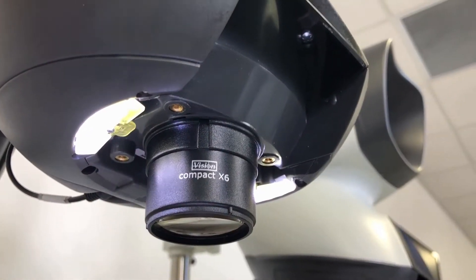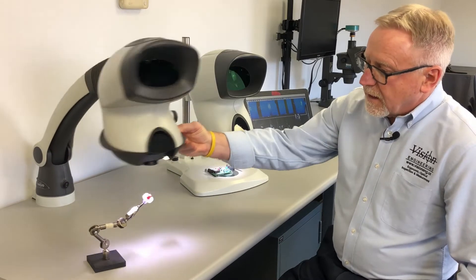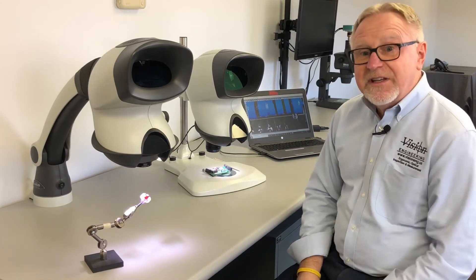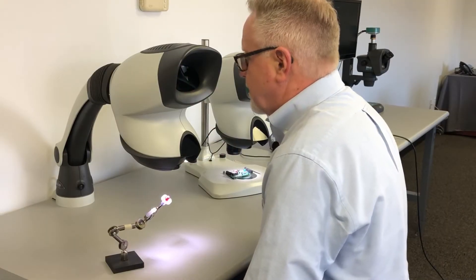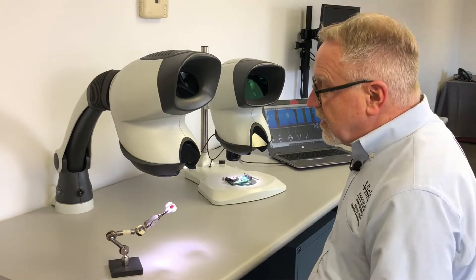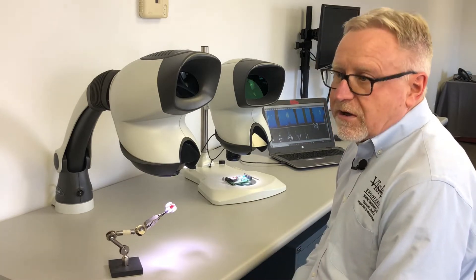The system incorporates built-in LED lighting for white shadow-free illumination. It's available on a very flexible universal stand, and also available on a bench stand that the Mantis Elite is sitting on. The system offers a very high-resolution stereo image that's easy on the operator's eyes and easy to use in general. Working distance is good — at 4x magnification you have about three and a half inches — quite often used for assembly and rework in addition to inspection.